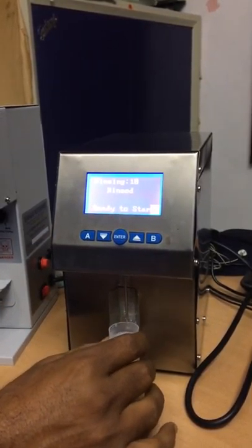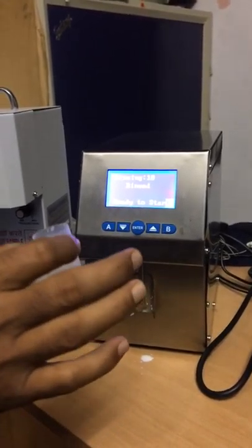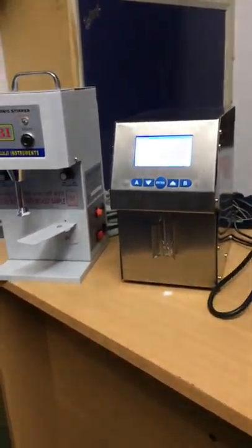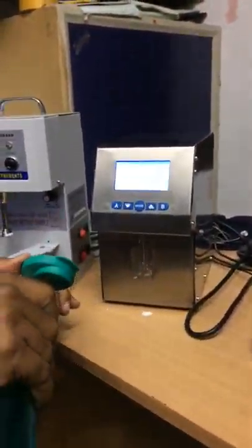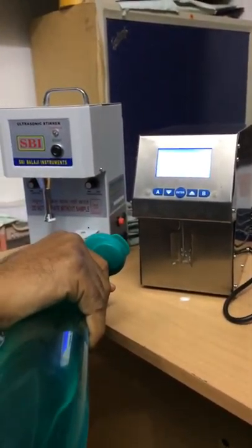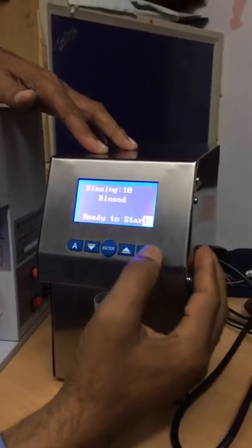The 10-times cycle is completed now. You just throw the water, take some more fresh water, and press B again.